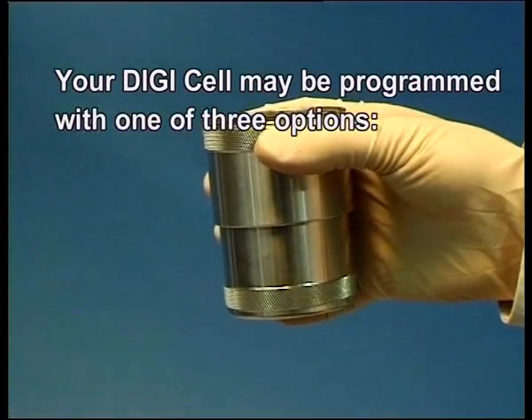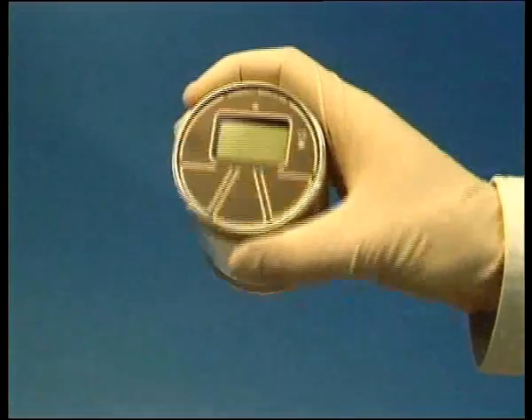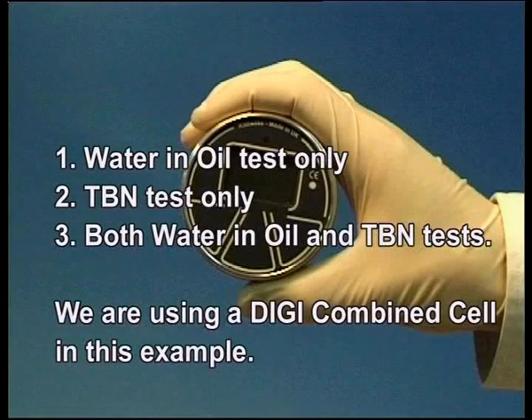Your DigiCell may be one of three options: water in oil test only, TBN test only, or both water in oil and TBN tests. We are using a DigiCombined cell in this example.